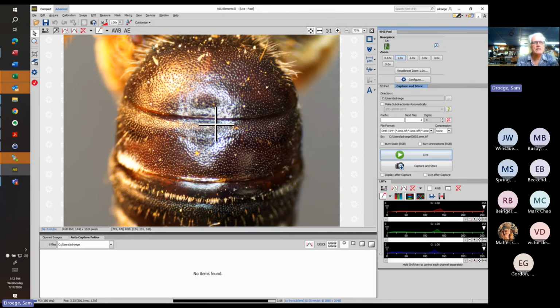So just to give you some indication that you can't always come up with some absolute measure, because this distance varies in the situation of how retracted it is or extended from underneath the previous segment. In this case, though, you can see that this is comprising a pretty high volume. We could say 0.75, no problem, maybe even more like 0.8. You can measure it, but usually these ID keys are designed to be done by eye.